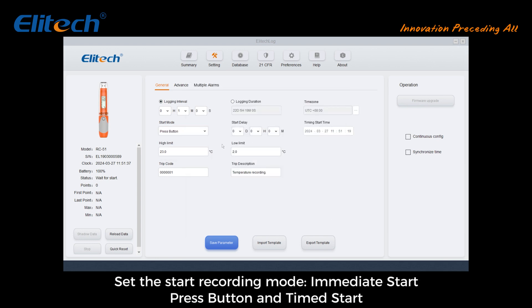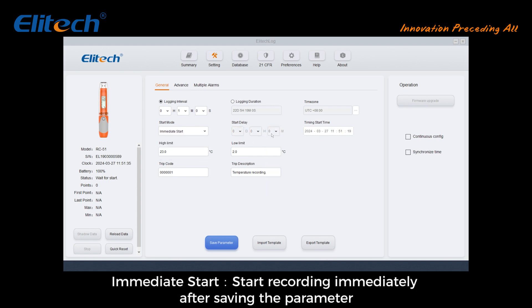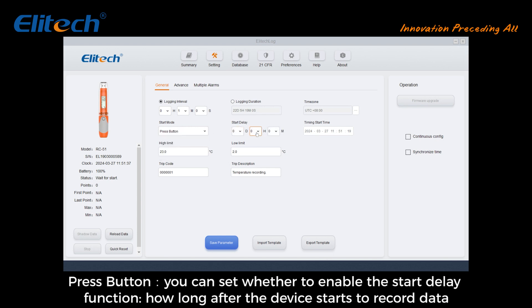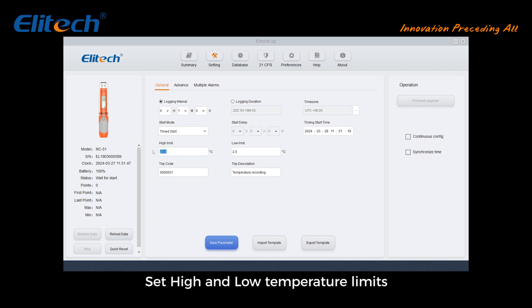Set the time zone and then set the start recording mode: Immediate Start, Press Button, or Time Start. For Immediate Start, recording begins immediately after saving parameters. You can also set whether to enable the start delay function to control how long after the device starts before it begins recording data. For Time Start, you need to set a specific start time.